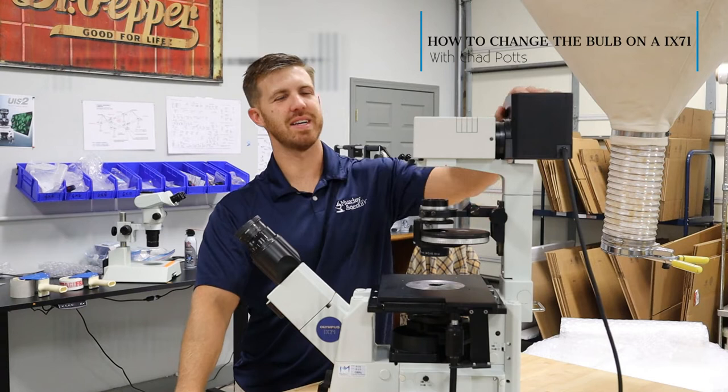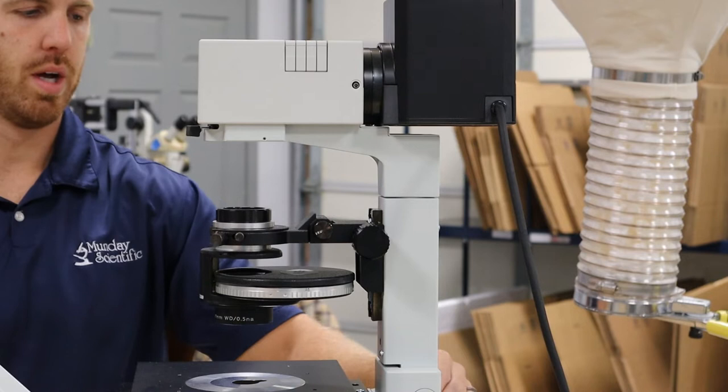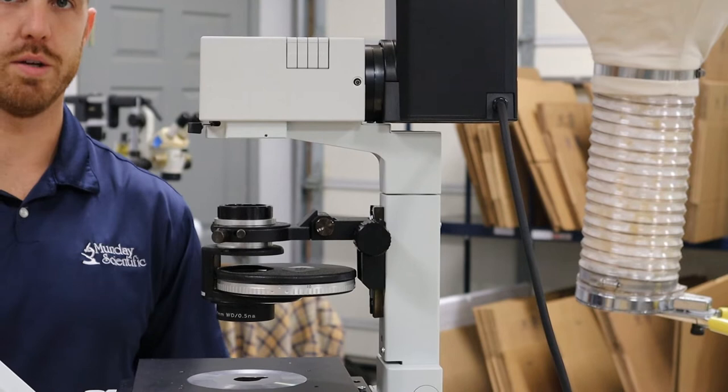First, we're going to grab a three millimeter Allen wrench. Sometimes the wrench will be back here in the back of the scope — it's on this one, we'll show you in just a second where it's at. I like to use a pack of wheel wrenches, so I got my three mil here.